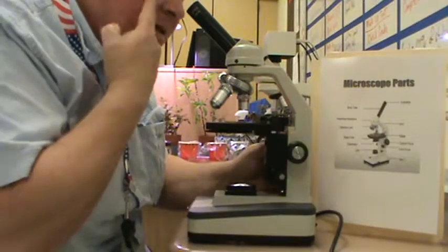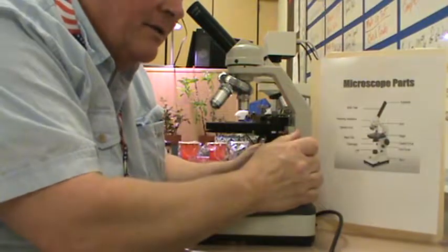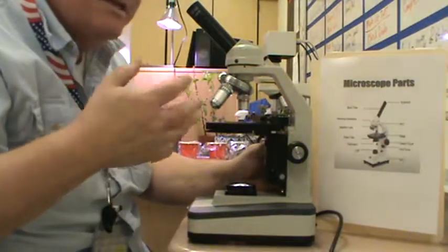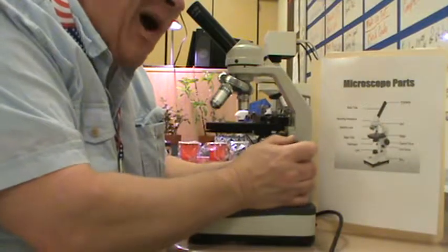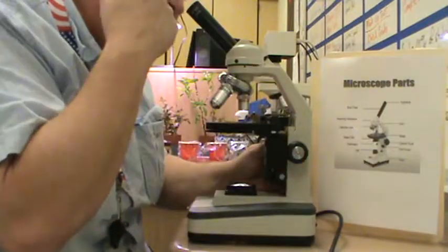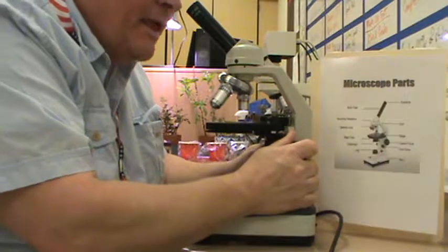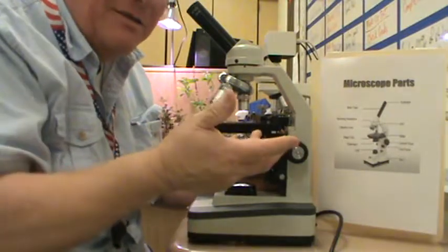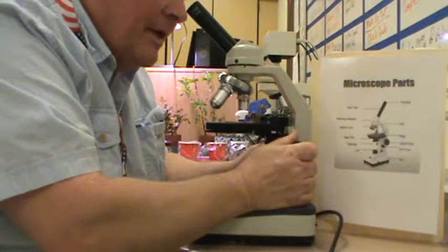And you'll also notice this eye is open. The object of the exercise is that you need to train your eye so that you can see through the microscope and keep this eye open. Students ask, why is that? Well, if you're doing this all the time, first off, you're going to start talking funny, and this is going to get very tired, and you're going to have this permanent wrinkle in the side of your eye. So, train your eye. If you need to, you can put one hand over, or you could actually go, I guess, to your local department store and you could get an eye patch and use it. But we want to have both eyes open.